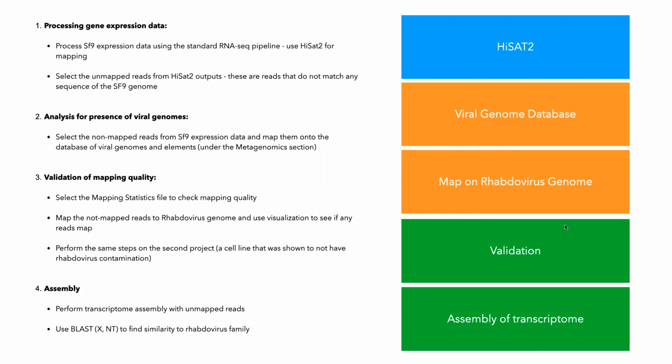And then potentially also performing assembly, to make sure that if it's a novel variant of the same virus, for example, when they discovered the novel coronavirus, they didn't have a reference yet. They had to use some SARS-1 or other bat viruses as a reference initially, and only then assemble all the reads that we have into some kind of a variant of that same genome.